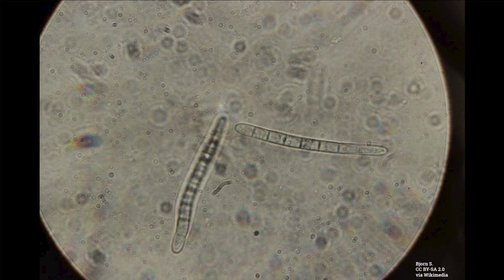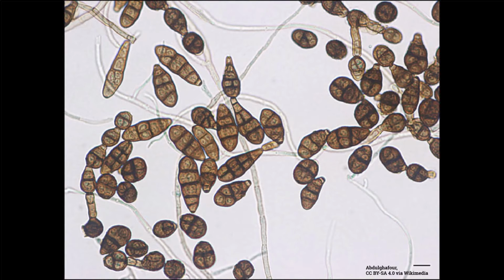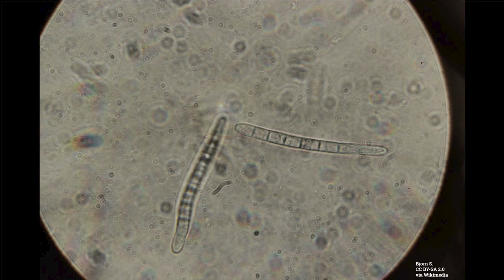Okay. What do Cercospora spores look like? They're long and cylindrical, almost like the blade of a sword. It's very, very long and thin. How do the spores of Cercospora compare to the spores of other diseases? Well, it's hard to describe, but alternaria would to me look more like a club. It has a thin handle on it, or maybe more like a tennis racket. It's got a bulbous end on one side and sort of a handle on the other. And with Cercospora, it would be cylindrical the whole way, like a mop stick or broomstick.